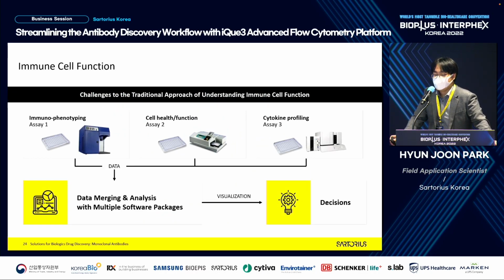What we can propose you in this process is that we have phenotyping or the antibody T cell reacting ones or immunophenotypes as well. So second one is the target cells or on the effector cells. You can see the diversity of it. The third one is to see the changes of the immune system like cytokine.